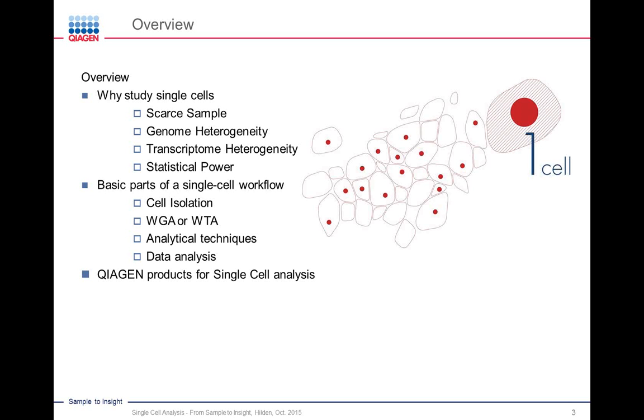After this, I'll touch briefly on analytical techniques. So maybe you do microarrays, maybe you do PCR, but this will depend very much on the research question you're particularly interested in, as well as the data analysis. At the end, I'll touch briefly on QIAGEN products for single cell analysis, and I'll focus there primarily on the whole genome or whole transcriptome amplification.